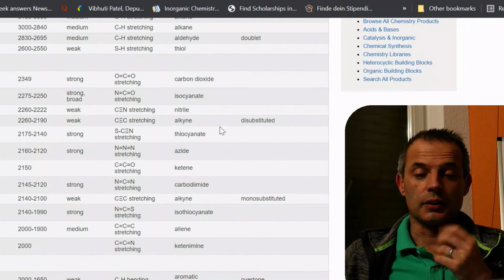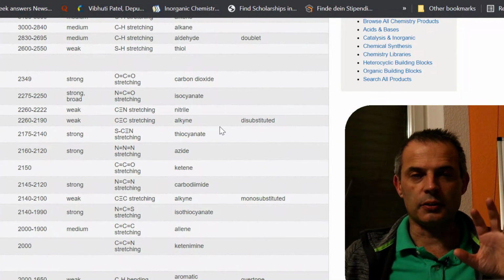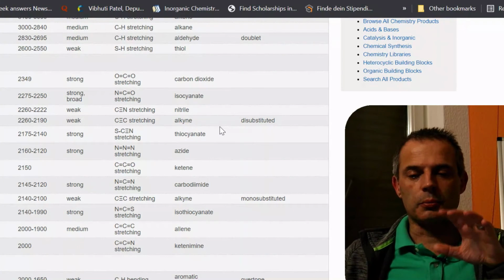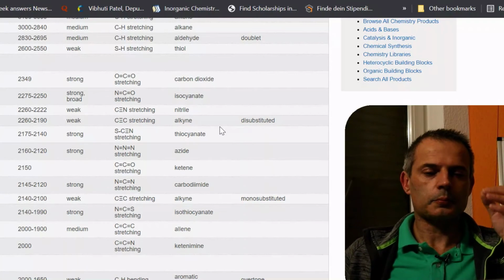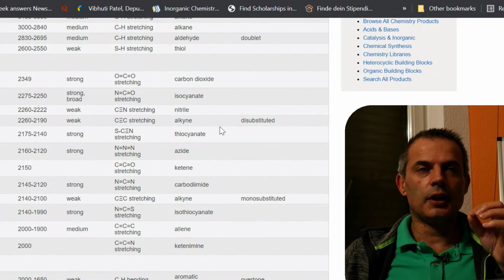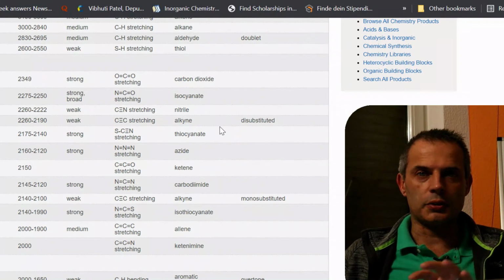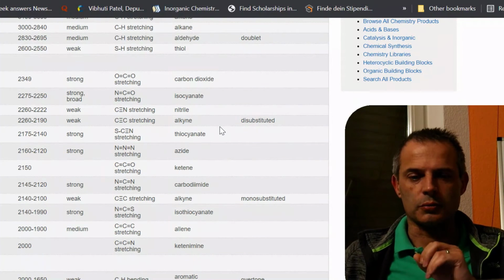If we use an attenuated total reflection, an ATR, like the one we have, like the one I explained to you just before, it's all sealed. So it's comparatively easy to keep the atmosphere constant. And what that means is we can get rid of the carbon dioxide peak almost entirely. But in an old style infrared, it wasn't possible.